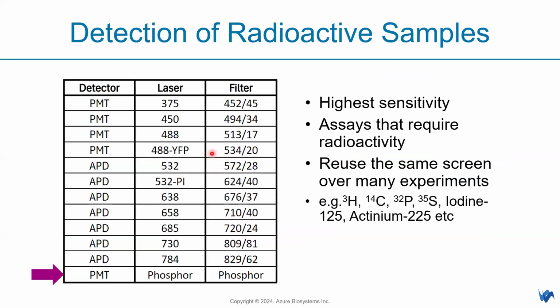First, here's a list of the optical modules, like lasers and filters. And one thing I forgot to mention: in Sapphire FL, we use PMT and APD. A combination of PMT and APD is dedicated for each spectrum. For the PMT, the best quantum efficiency is at the lower range of nanometer wavelengths, like from the Cy2 range, so we use a PMT there. And APD will be the one that we dedicate from Cy3 and above.